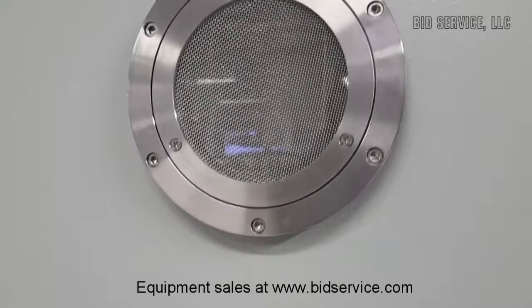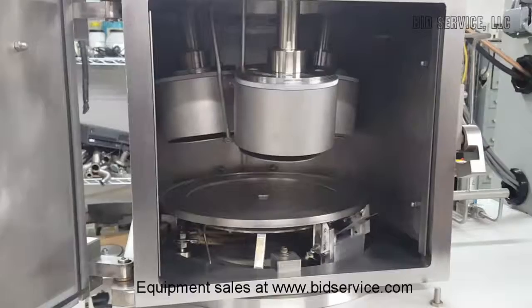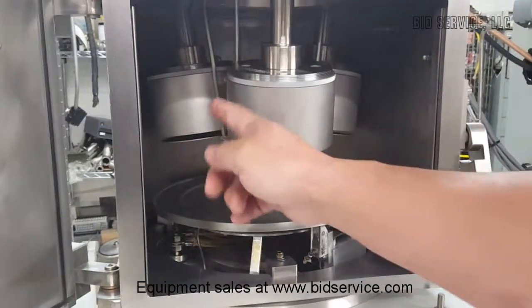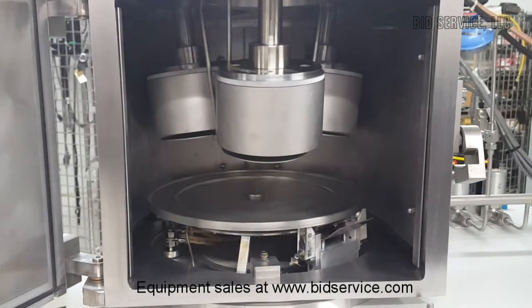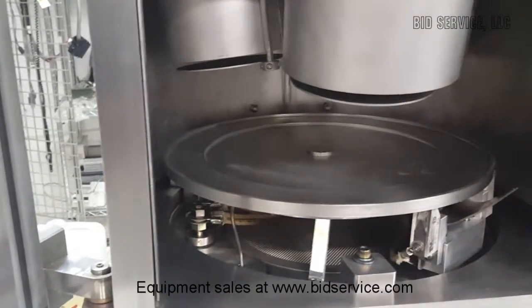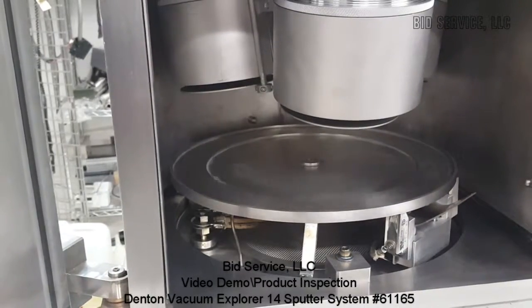There you go — here's your chamber. This is your cathode 3, over there is your cathode 2, and cathode 1. I can also show you the rotation. Go to 50 — there's your rotation. Put it at 100 to speed it up. And I can slow it down — I'll set it at 10.